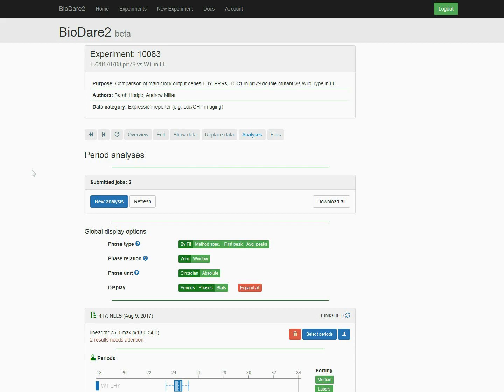In this video I'm going to present period analysis in BioDare. If you haven't seen our previous video about data import, please check it out as you might learn a trick or two. So I click New Analysis.